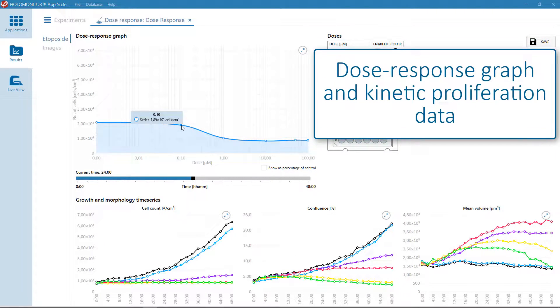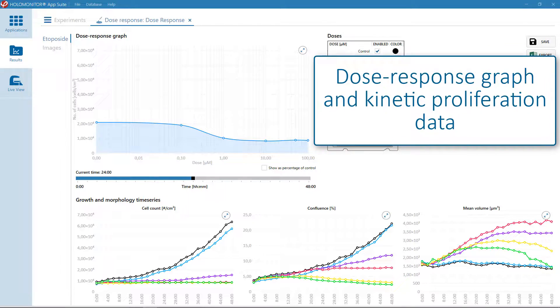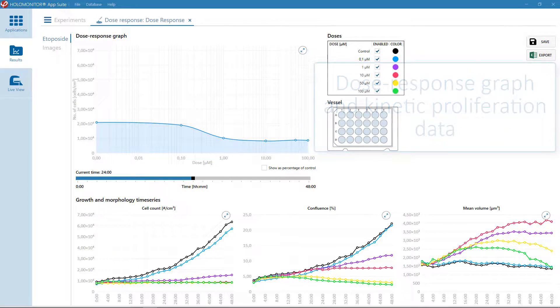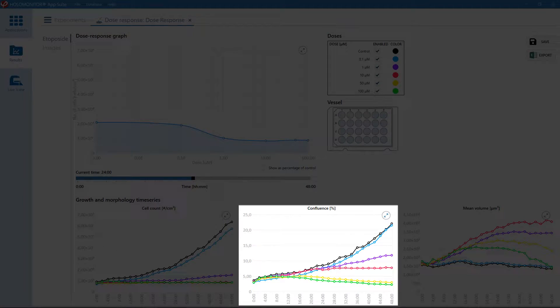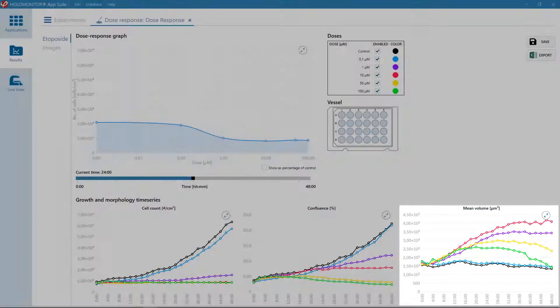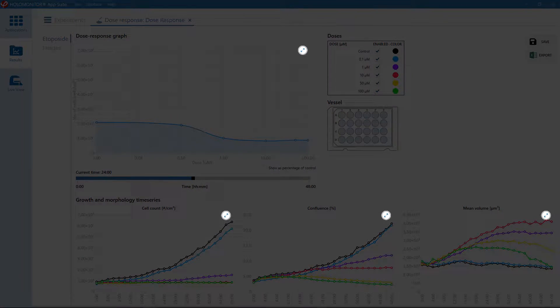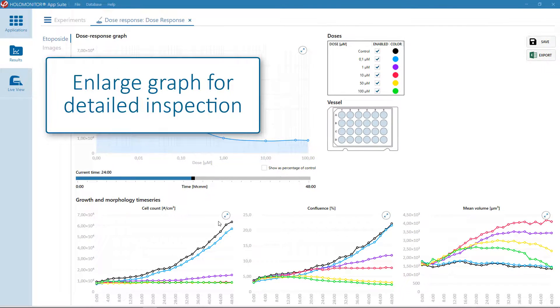You will also get kinetic proliferation data presented in graphs showing changes in cell number, confluence and cell volume over time. Each graph can be enlarged for a more detailed inspection.